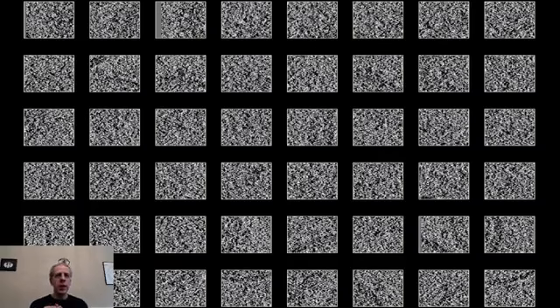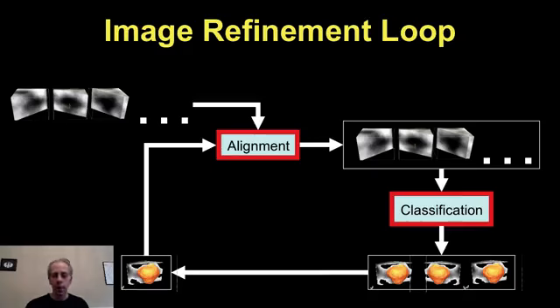This is what you see. This is your raw data. You put the virus, you did the cryotomography, you basically put all the tilts together. This is what you see, and you say, oh boy, what am I going to do with that? But you remember that you just developed an algorithm that is working for other things. So you plug your algorithm into that.